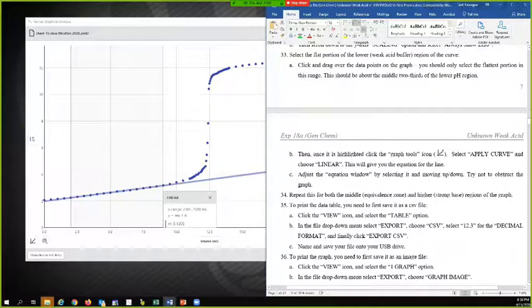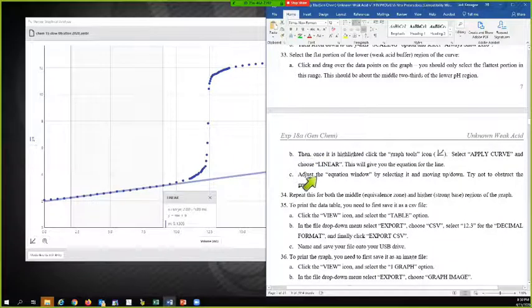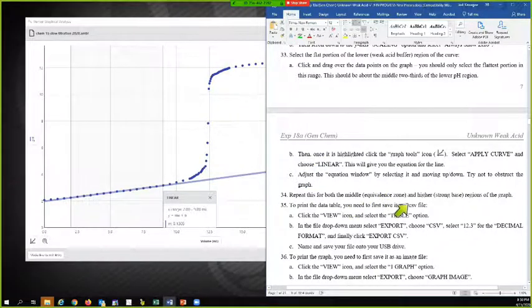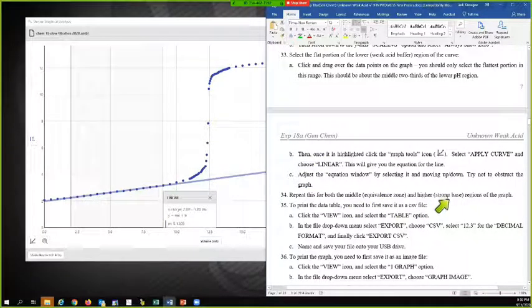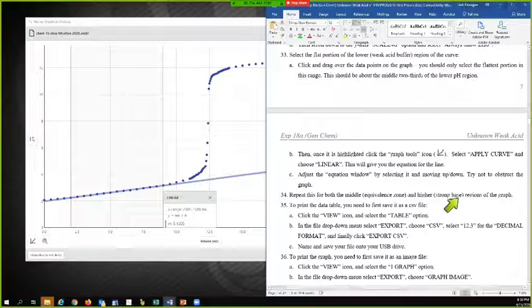Repeat this for both the middle, the equivalent zone, and the higher, stronger base regions of the graph. So I'm going to go back over here.